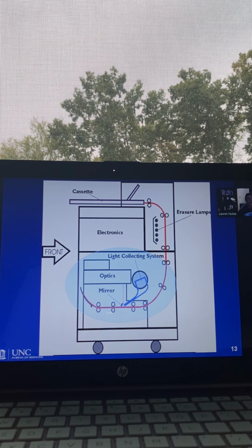Okay, so I'll come back to that question in a second, Casey. I'm kind of getting there. But does it make sense why when you first put it in, these lights don't turn on? We don't want these lights turning on as soon as we put that plate in the reader, because then what happens?